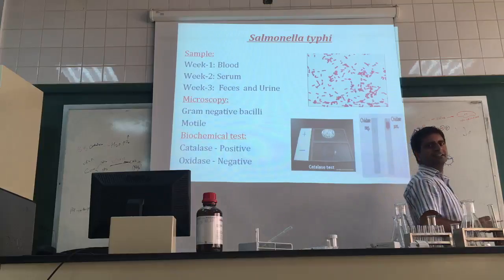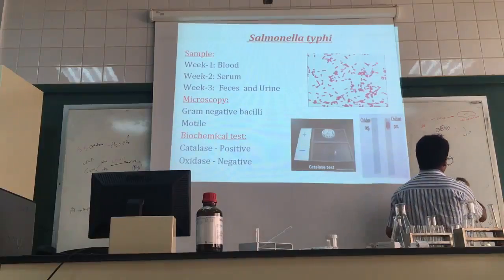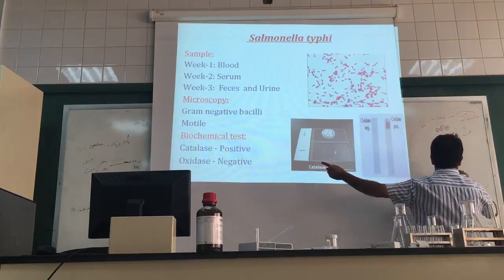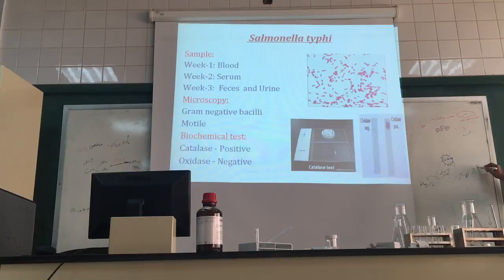You are in the third year. Hydrogen peroxide, H2O2. Correct. This microbe is catalase positive. This means this bacteria has an enzyme. The catalase in this bacteria attacks H2O2, hydrogen peroxide, and makes it into water and oxygen. The arrow up is the gas bubbles.